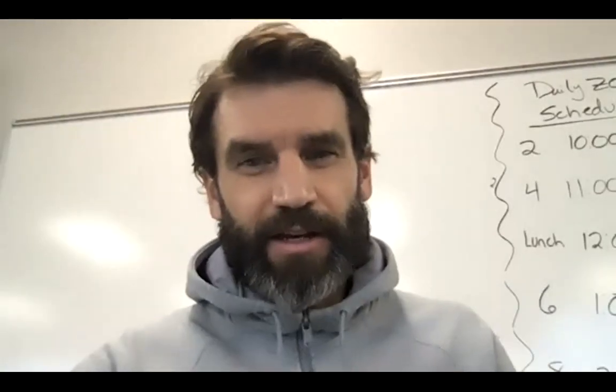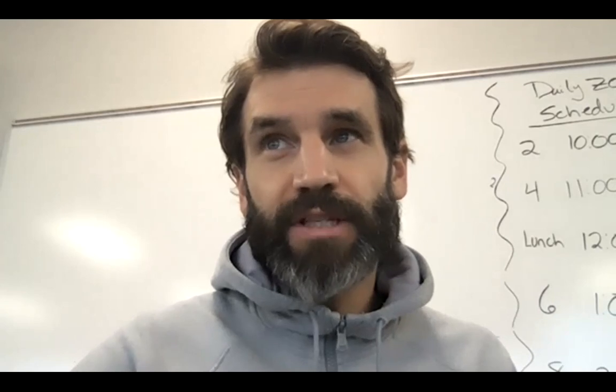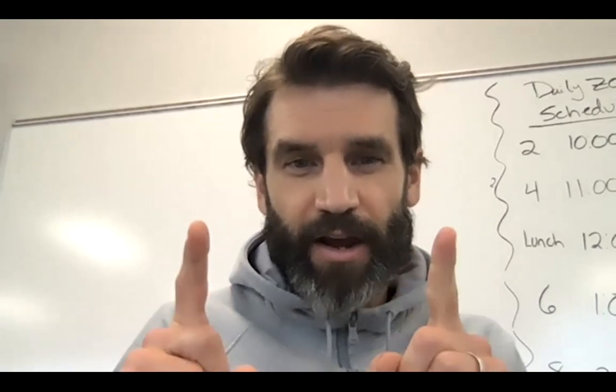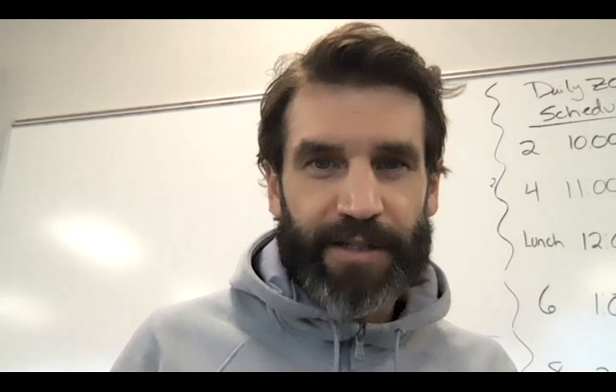I wanted to make a short tutorial video to show you how to use the NCBI BLAST tool in order to identify what gene a mystery piece of DNA comes from. And most of you are probably here because that is a practice assignment that you have today. So I'm going to show us how to do that.